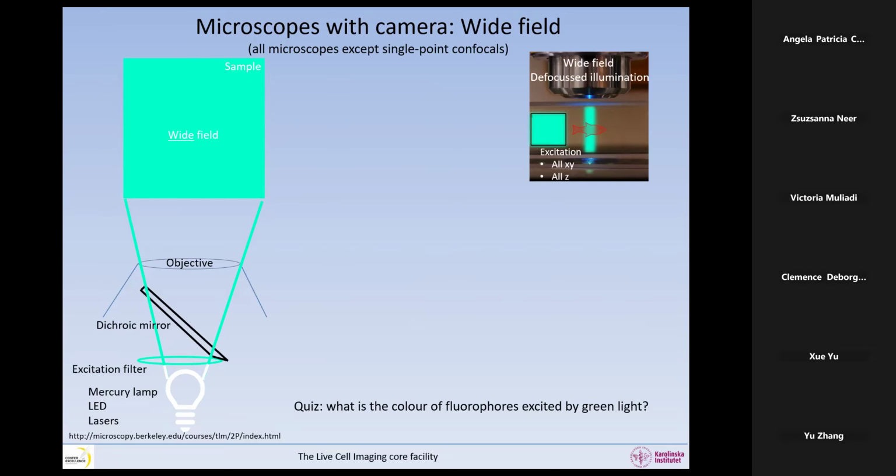So if you remember the fluorescence lecture that we had, we have the fluorophore and it gets some light of a certain color and then shake, shake, shake. It loses a lot of energy through vibrations before it finally spits out a photon with the emitted light. And because of this loss of energy through vibration, the emitted light has less energy than the excitation light.